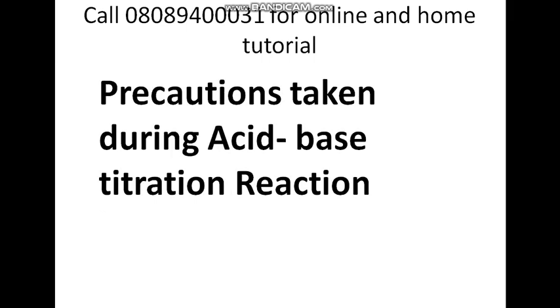Now I want to discuss the precautions taken during acid-base titration reaction. There are some precautions that have to be taken during acid-base titration reaction in order to ensure accurate titer value. These precautions are as follows. 1. Small quantity, that is 2 or 3 drops of indicator solution is used in order to ensure clear and sharp color change at end point.